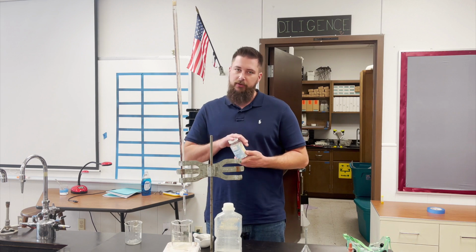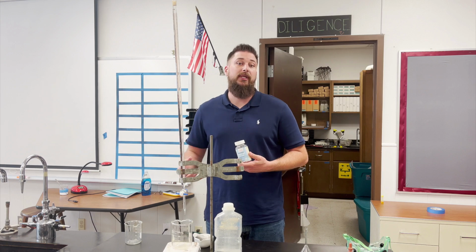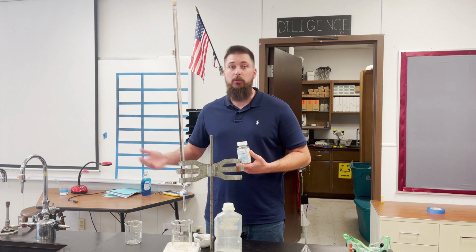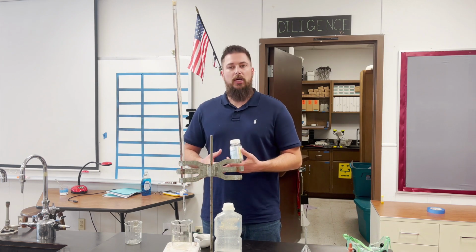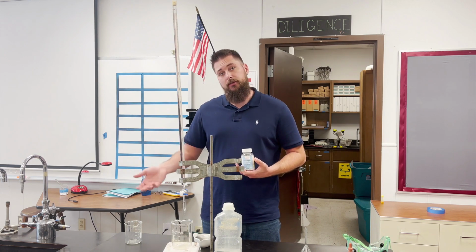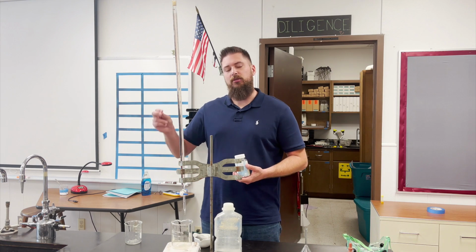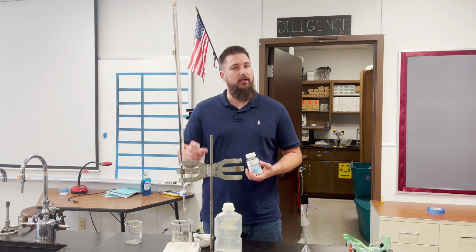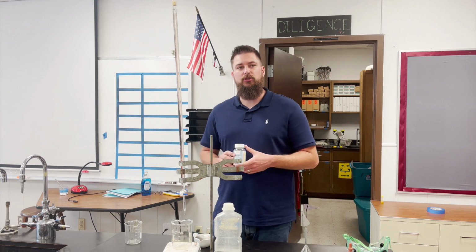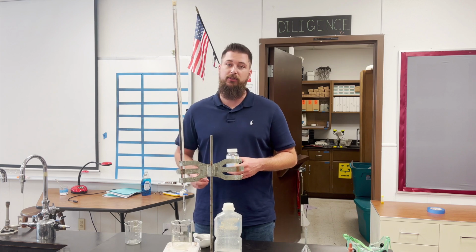This is a very practical lab in terms of a real world application, because many times, especially in a field like pharmaceuticals, when companies develop the processes that create their medications, they want to do quality control by analyzing their production to make sure they are in fact producing what they claim. For some medications it's extremely important that they are very precise and accurate.